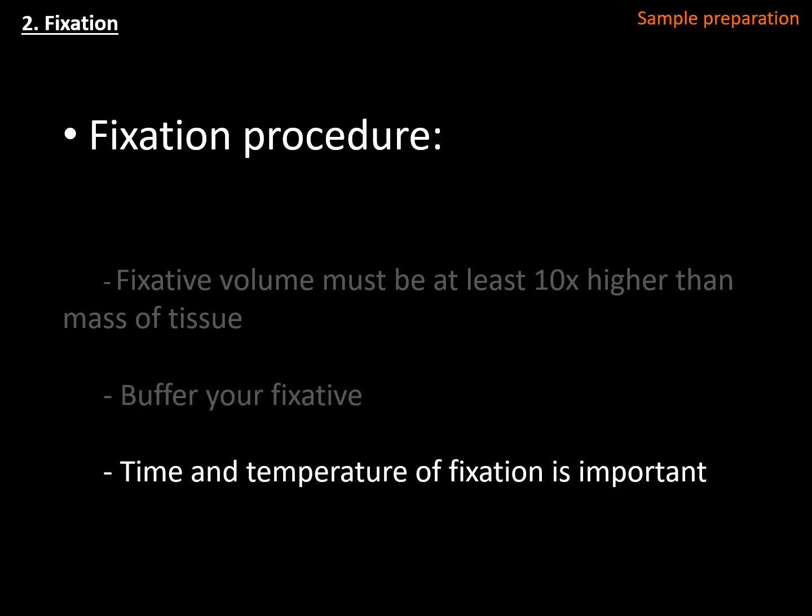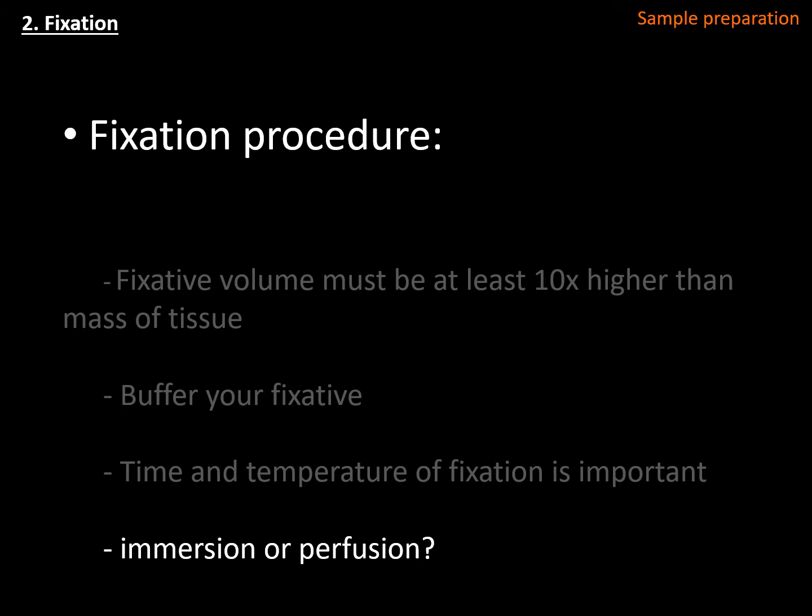As well, time and temperature of fixation is important, because we are promoting chemical reactions or physical-chemical changes in your sample, and both time and temperature will influence those. So a good equilibrium between time and temperature will allow you to have the best results possible. Another aspect that you have to think about is if you want to fix by immersion, this being putting your tissue into a vessel with the fixative, and the fixative will then permeate through the tissue and fixate it.